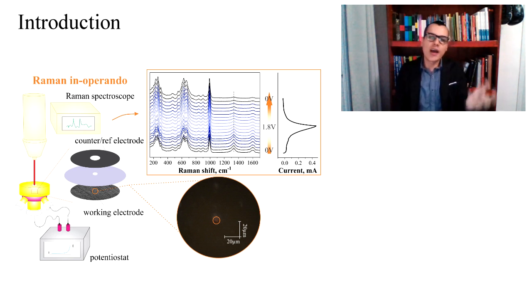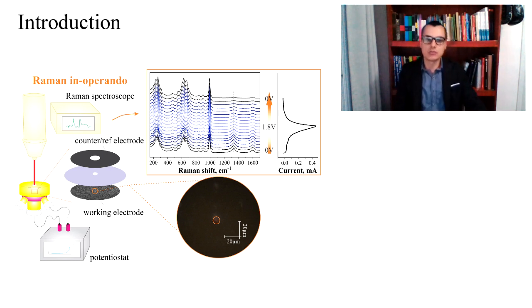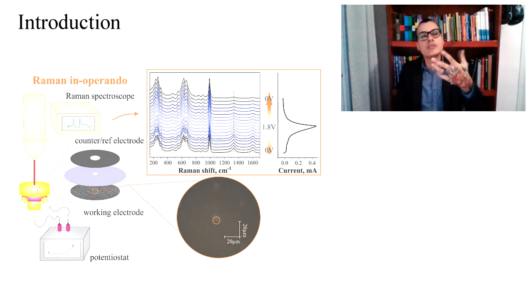It was expected to find processes previously described here, such as ionic intercalation, or even to verify the carbon-based material degradation. However, we noticed a reversible shift at the D-band position, according to the charge and discharge processes of our supercapacitor. In today's presentation, I will present all the peculiarities and characteristics, as well as discuss possible explanations for such a D-band shift. We believe that we have found an innovative possible explanation for this phenomenon.